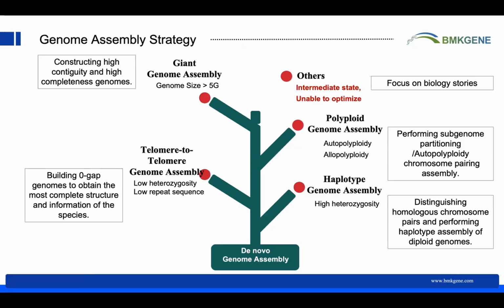Here is also a very complex example. It's about larger size assemblies, because this will use more data and has higher requirements for compute resources. So it's also very complex if the genome size is very high, but we have experience with this.